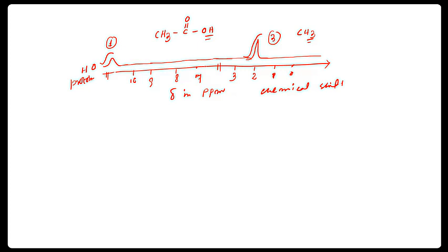So from the integration, we can say the number of protons. This is a very valuable, important statement: from the integration value, we can predict the number of protons.